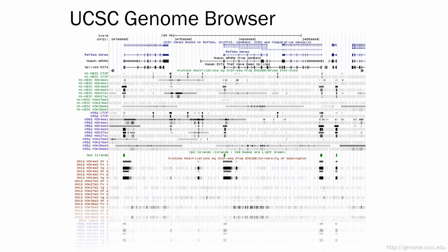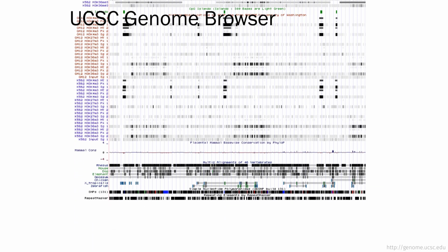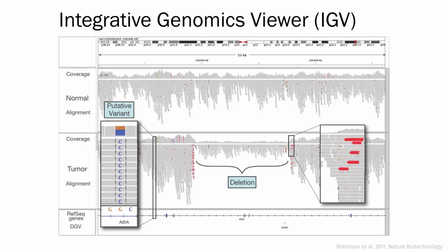One challenge though with these things is often that the list of tracks that you want to add here gets pretty long pretty quickly, which then turns us a bit into a visualization problem, because now you can no longer see what's at the top of the page that we might want to refer to, or we might want to correlate a pattern we see here with something that's further up. So from a visualization point of view, it's always a problem to scroll around, because that means you can no longer see what your visualization was meant to show.